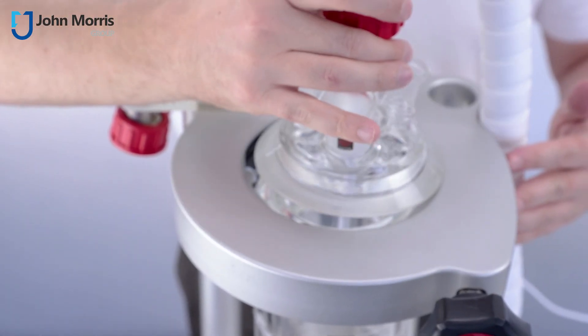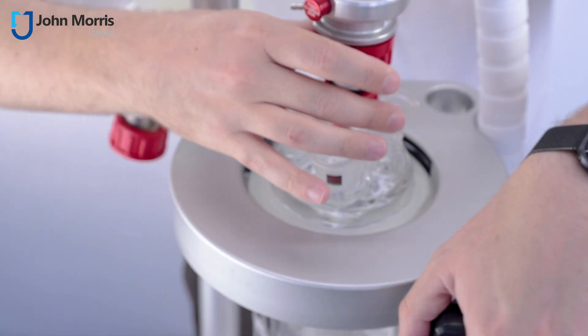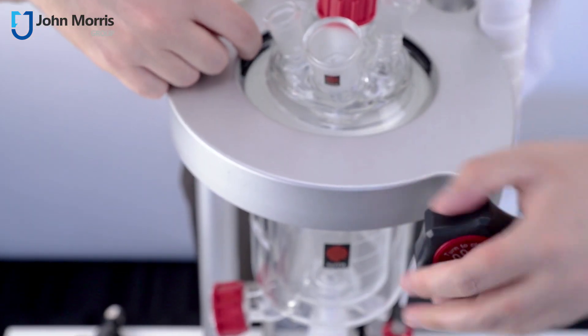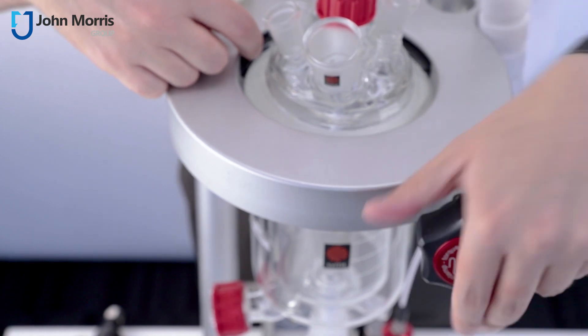So the lid goes on just like this and tightens here from the front, and you can see these three teeth coming in to secure the lid to the actual vessel.